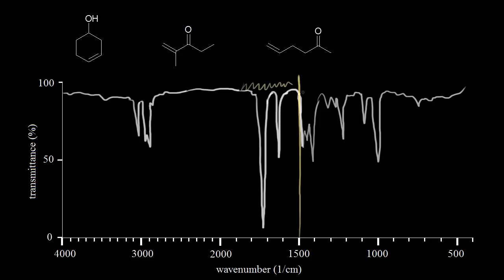So two signals, two clear signals in the double bond region. Let's look at this signal right here. All right, so it's not as intense as the other one. And it's pretty much between 1,600 and 1,700. So both those factors make me think carbon-carbon double bond stretch. So this is probably a carbon-carbon double bond stretch here.